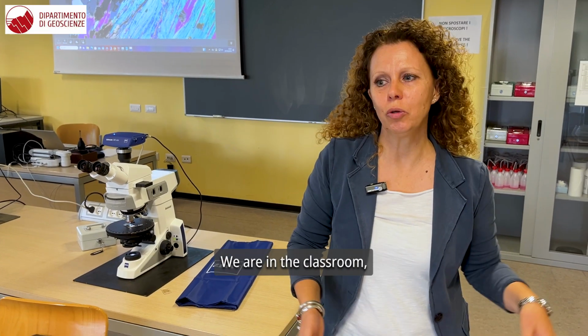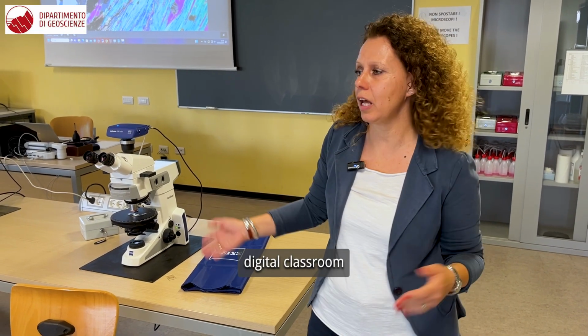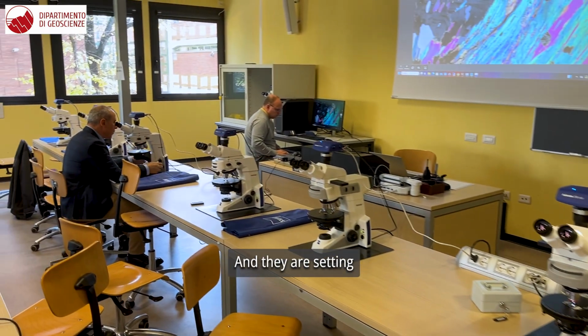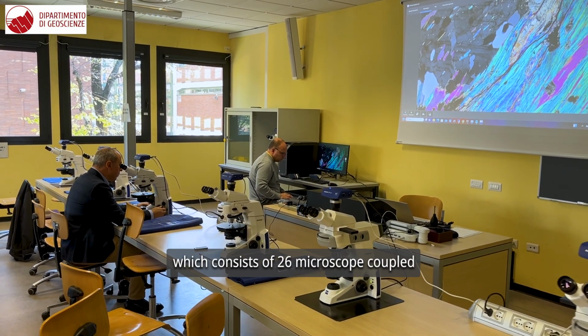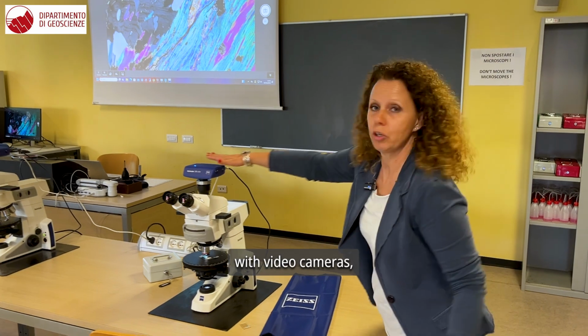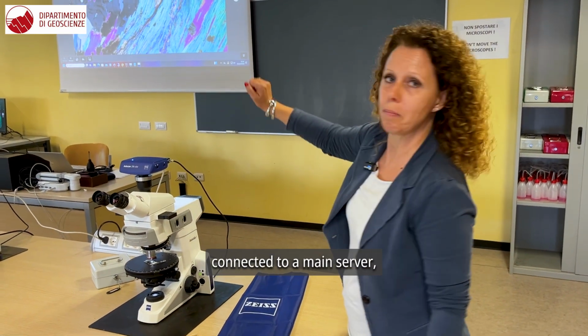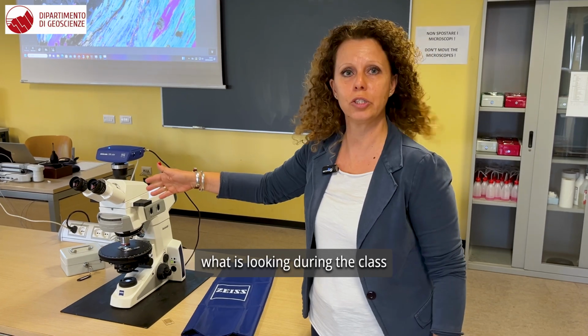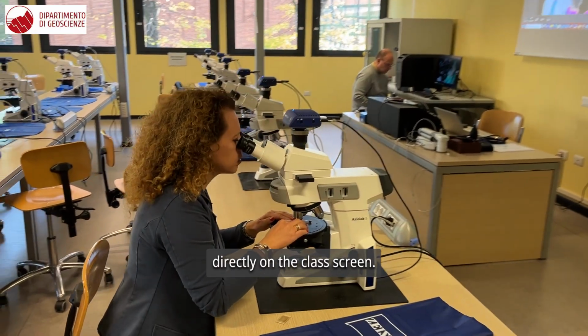Welcome to everybody. We are in the digital classroom of microscopy of the Department of Geosciences of the University of Padua. You will see people working around today, setting up the new digital classroom, which consists of 26 microscopes coupled with video cameras connected to a main server, which allow the students to project what they are looking at during the class directly on the class screen.